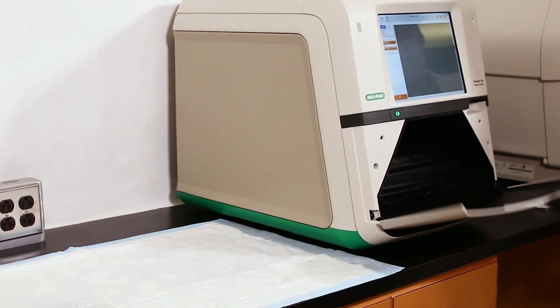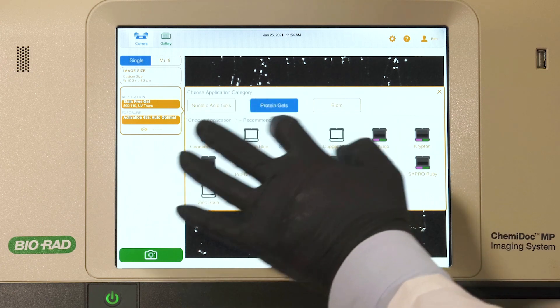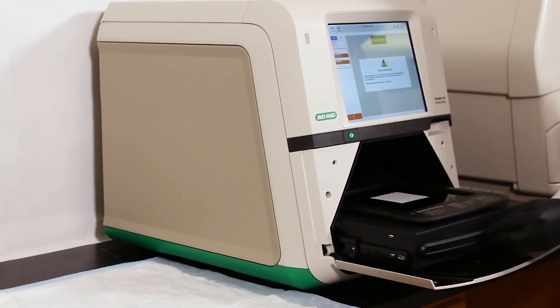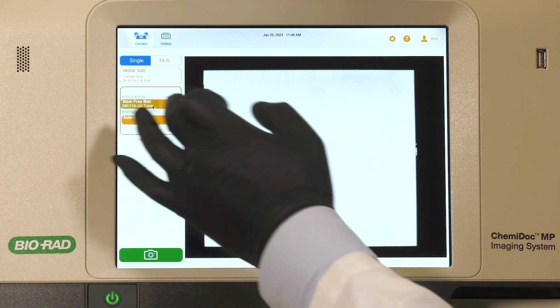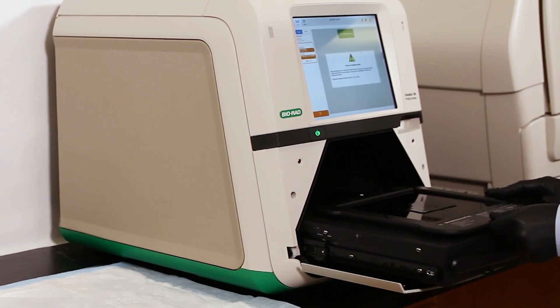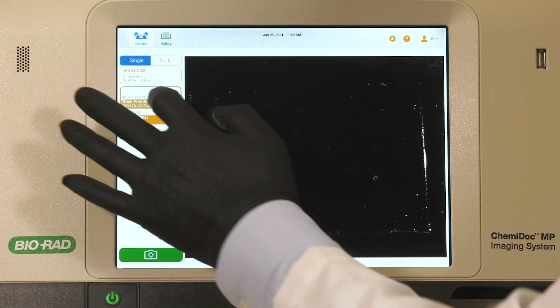After electrophoresis of protein samples, the gel is placed into a stain-free enabled imager. Within a minute, the total protein signal is captured and displayed. If gel resolution is adequate, then proceed to the transfer step. After transfer, image the membrane to assess transfer efficiency. Next, quickly image the gel post-transfer to ensure that protein transfer is complete.